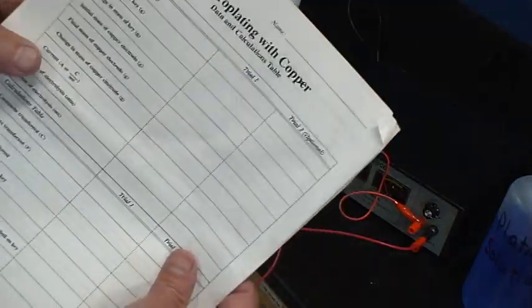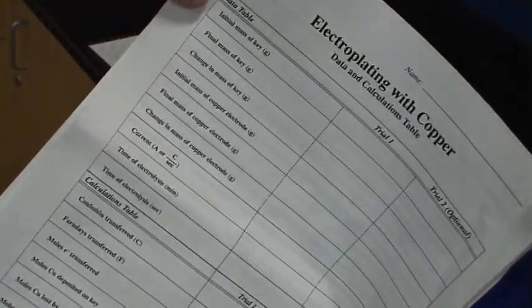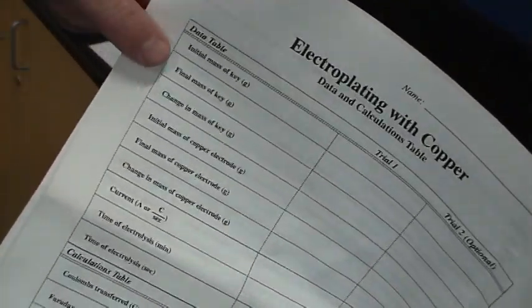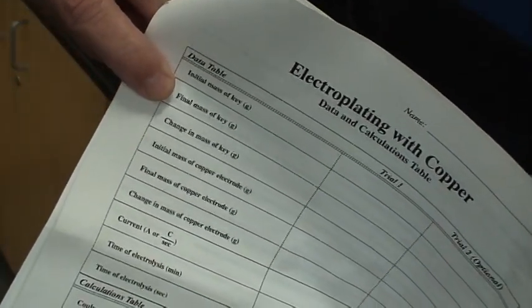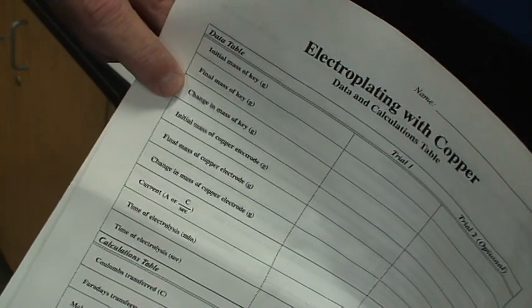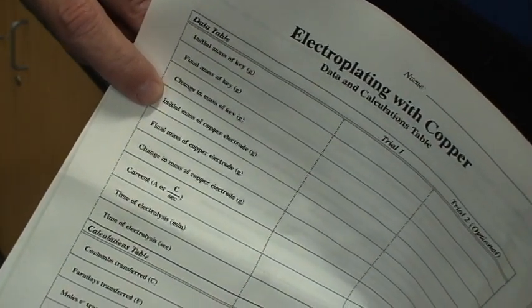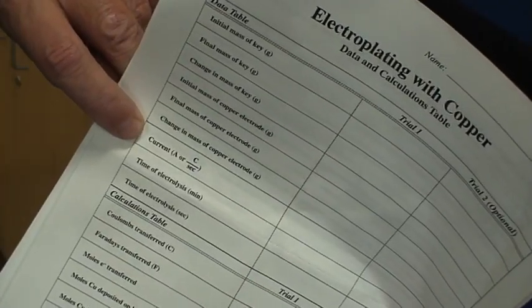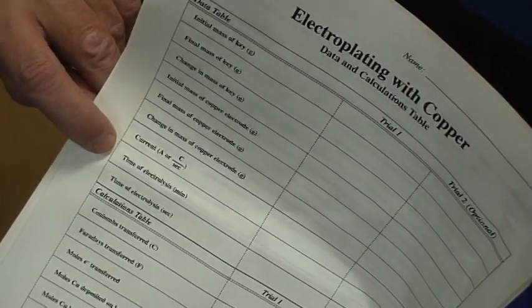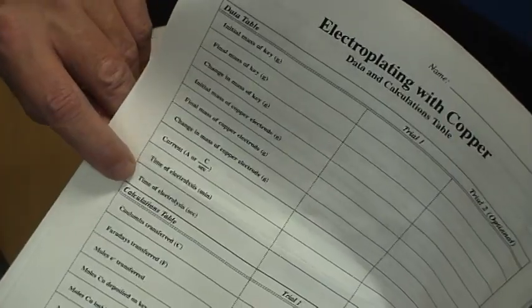While that's running a little bit, notice that we have an initial mass of our copper. We have an initial mass of our key, and a final mass of our key when we're done. We can see the change in there, and the initial mass of the copper sheet itself, the electrode, and the final mass. Then we take a look at the current, which is amps or coulombs per second, and the amount of time in minutes and seconds.